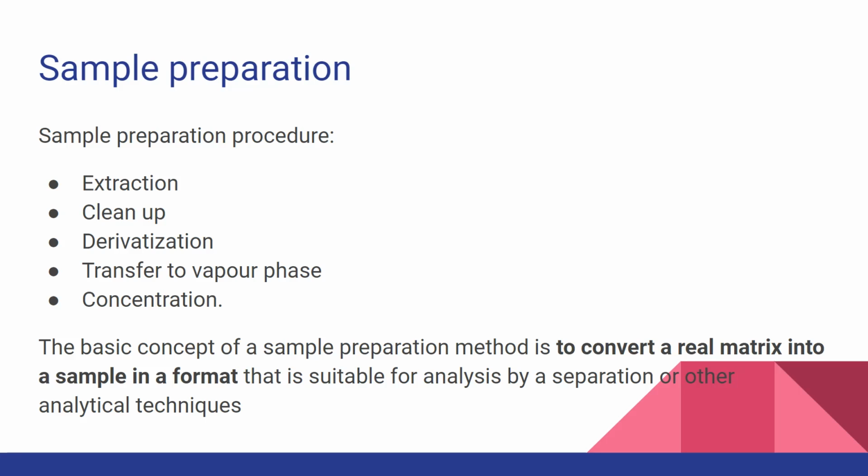The basic concept of sample preparation methods is to convert a real matrix to a sample in a format that is suitable for analysis by the separation or other analytical techniques.